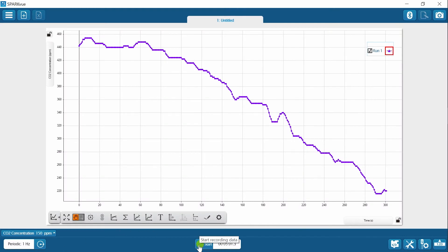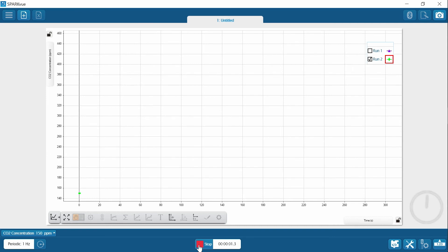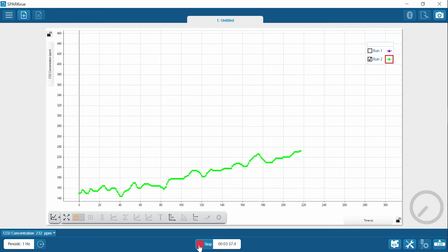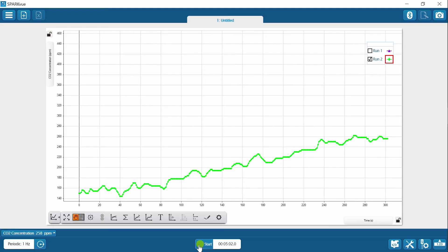Start part two by recording data again and collecting it for another five minutes. After five minutes, stop recording data. Sketch this graph onto graph one and identify the data run as dark in the key. Then identify the starting and ending CO2 concentration levels and enter that information into table one.